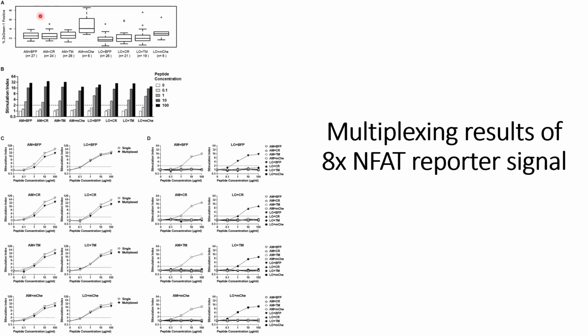Thereafter, these signals are measured once the T cells are co-cultured with autologous B cells that do not have the antigens to activate these T cell receptors. Next, they co-culture them with peptide concentrations, or the peptides, that can help in the activation of these T cells. They are able to see some signals even at the lowest concentration of around 0.1, I think it's microgram. In panel B of this figure, we can see that with the relative increase in the peptide concentrations, there is a relative increase in the signals.